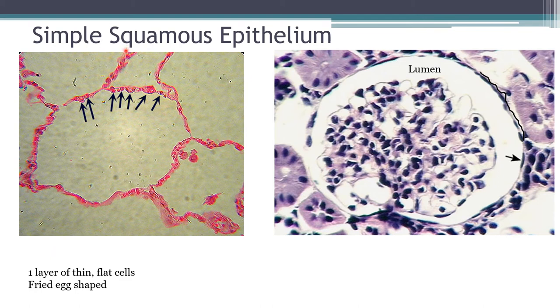Our first epithelium is simple squamous epithelium. Simple means one layer of cells; squamous means that layer is going to be thin, flat cells — like fried eggs. Notice the white space all over the place — that's lumen, that's the outside of the body. The epithelium is whatever cells are touching that white space. Here the cells are very, very thin and flat, and because they're so thin there's really only room for one layer of them — perfectly fitting this description of one layer of thin, flat cells.